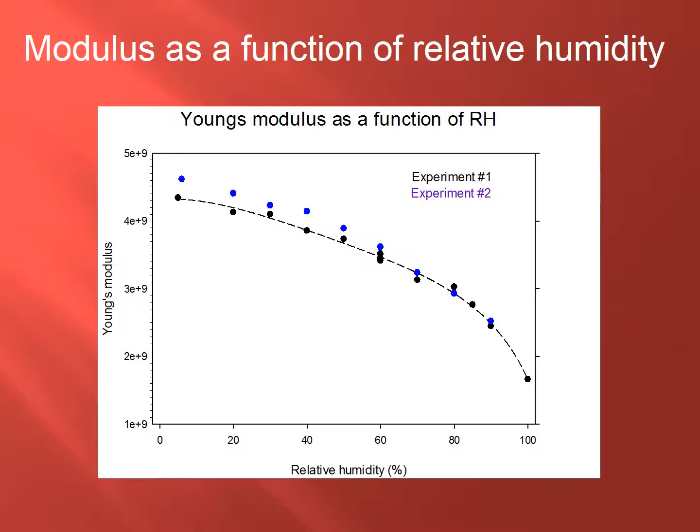After performing a selection of these types of experiments, it seemed conscientious to go back and check the reproducibility of the original curve for virgin hair. So we performed a comparable set of experiments on another set of 50 fibers procured from a different virgin hair tress, with the results being shown on this slide. At higher water content, maybe from 60 to 70% upwards, the 2 data sets agreed nicely, but at lower humidity we consistently obtained a somewhat higher modulus from this second set of experiments.